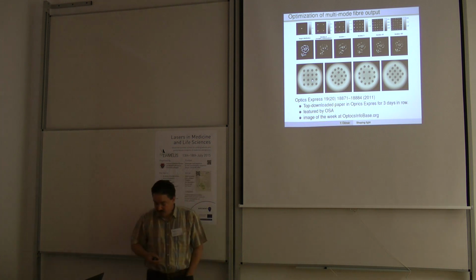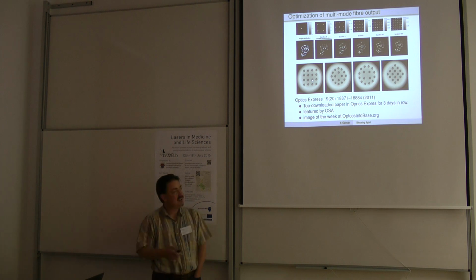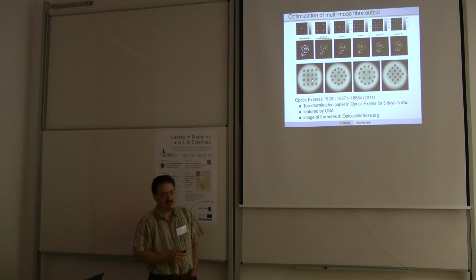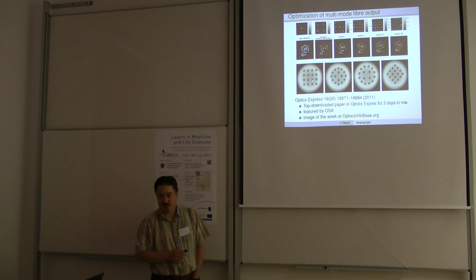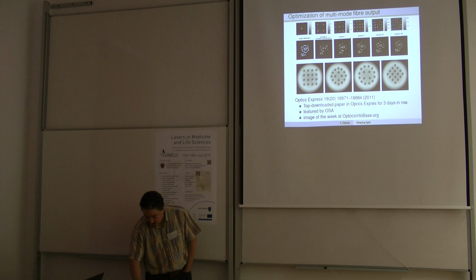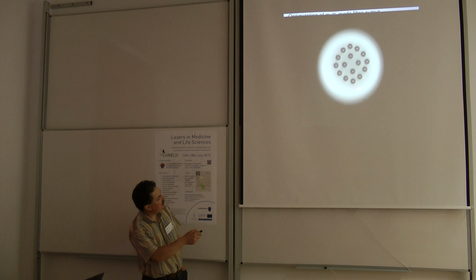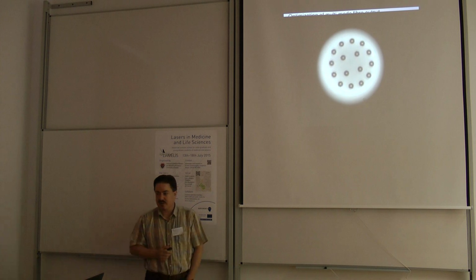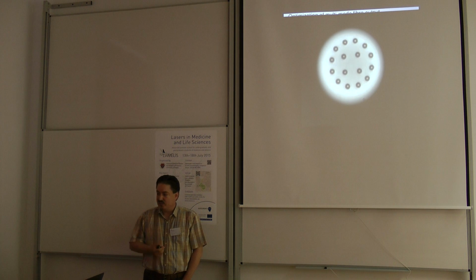Right? So I did a couple of changes in that, and these days I can create wonderful points without any background. Right? I can split the beam into as many beams as I want at the end of the fiber, or create any bizarre structures if you want. And I can also use it for optical manipulation. So here I have one fiber, and I'm trapping a couple of particles from the output that is reshaped in order to create all these optical traps.